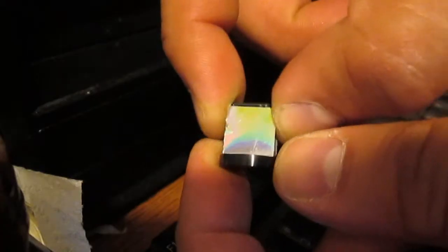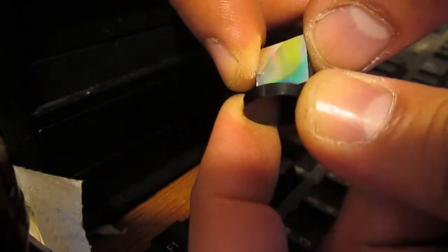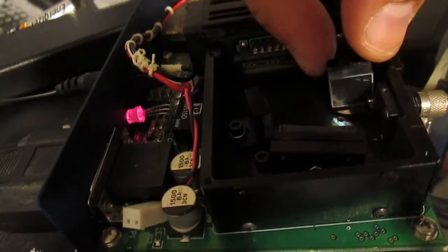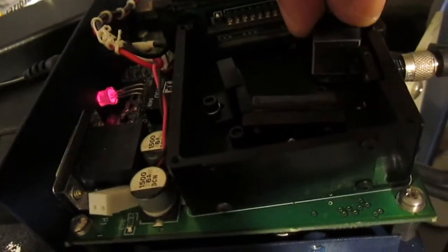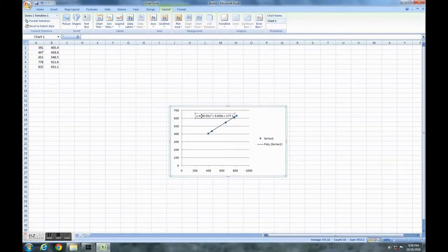So after removing the older grating with some difficulties, I installed the new one. And I'm not going to get into the details of the whole alignment process which is long and tedious. There's plenty of videos and procedures available online for this.